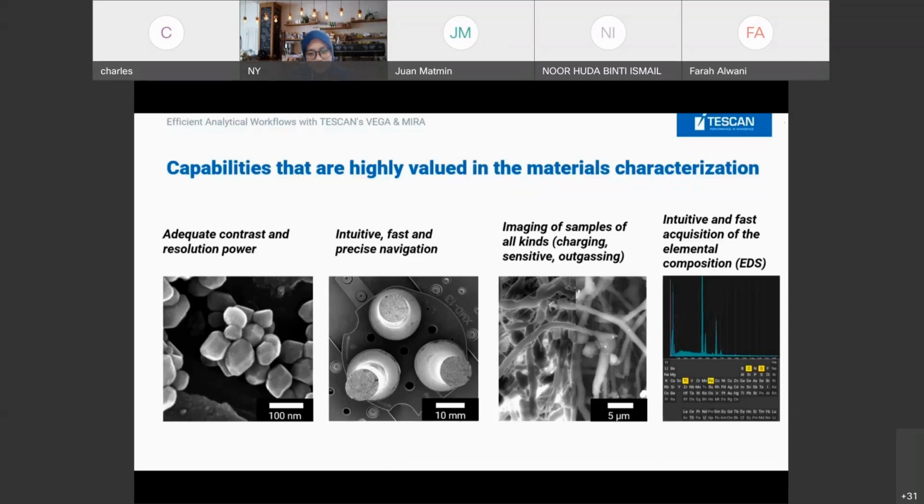So, of course, there's always a need for material characterization. So not just visualization, but material characterization by microanalytical tools. One example here would be EDS, the energy dispersive tool. Of course, there are other detectors like EBSD, WDS, and so on. Still, do you think this will highlight how advanced the SEM can be? Not really up to here.